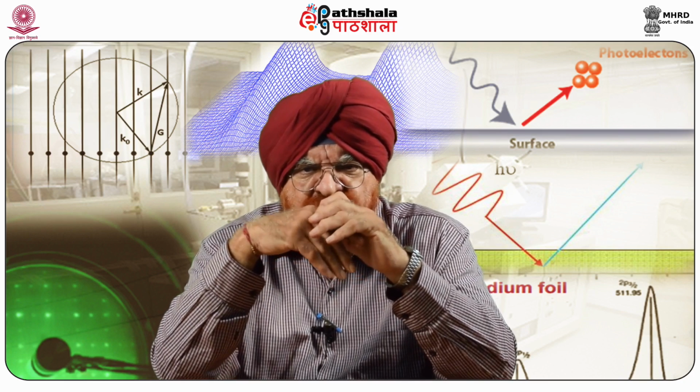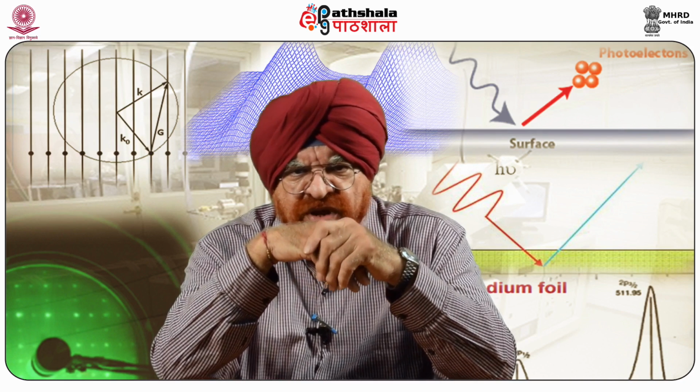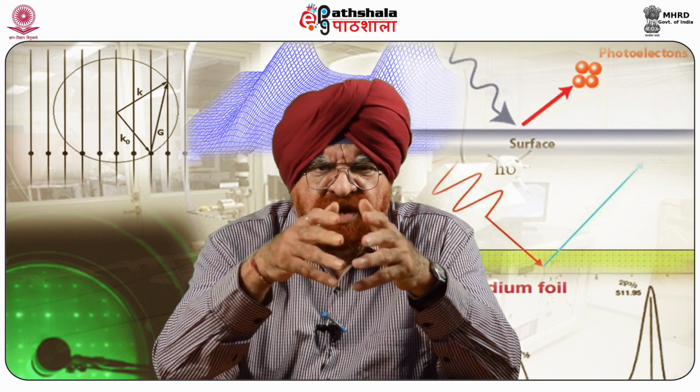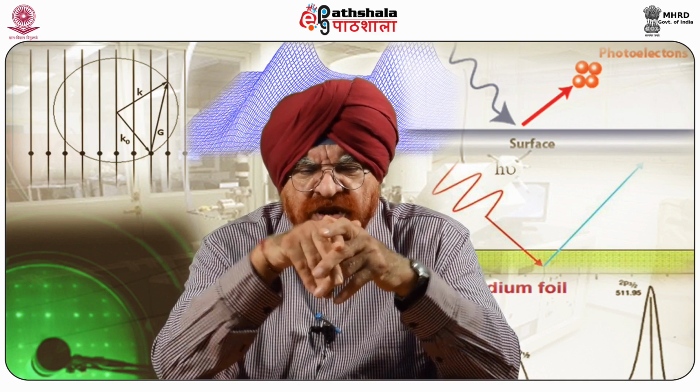The information XPS provides about surface layers or thin film structures is important for many industrial and research applications where surface or thin film composition plays a crucial role in performance, including nanomaterials, photovoltaics, catalysis, corrosion, adhesion, electronic devices and packaging, magnetic media, display technology, surface treatment, and thin film coatings used for numerous applications.